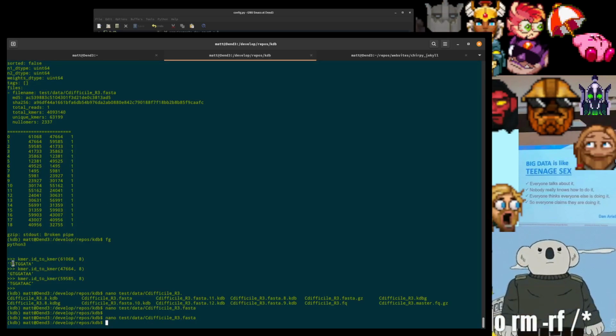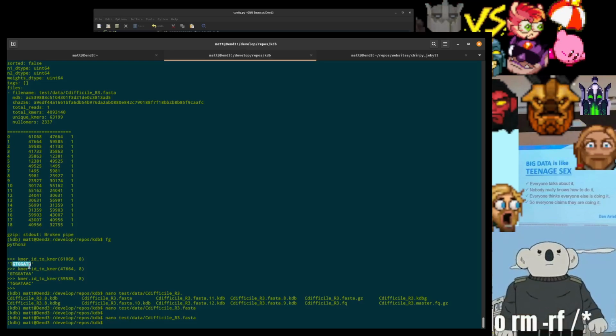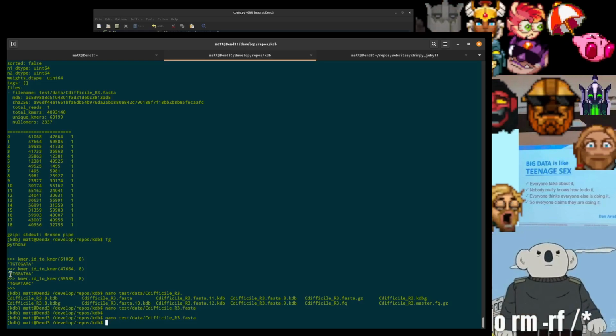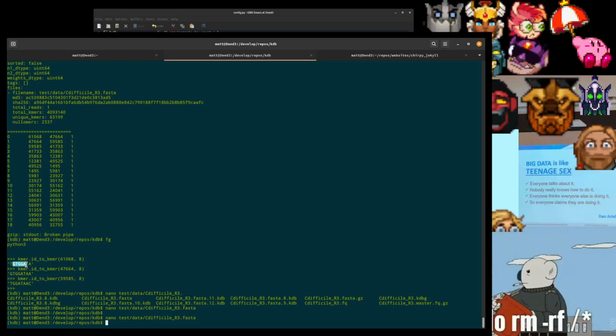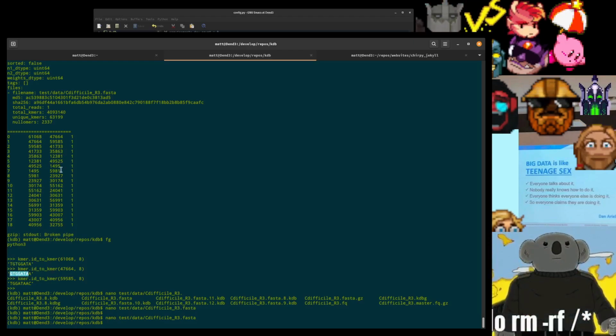You can also notice that in this sequence, the k-1 mer, or the 7-mer, GTGGATA, the last 7 letters are the first 7 letters of this next one, which we said were adjacent.